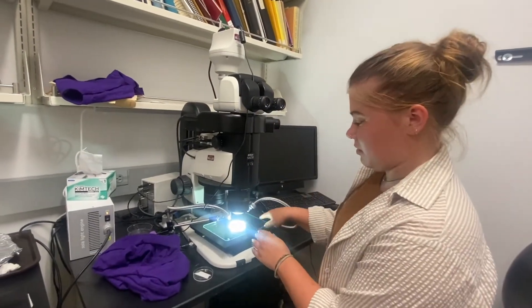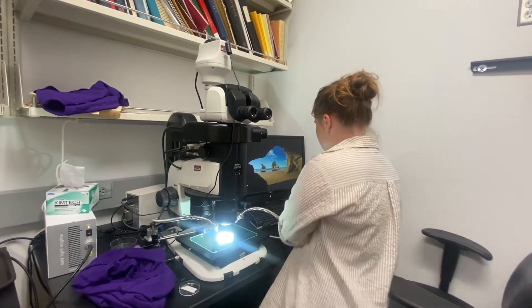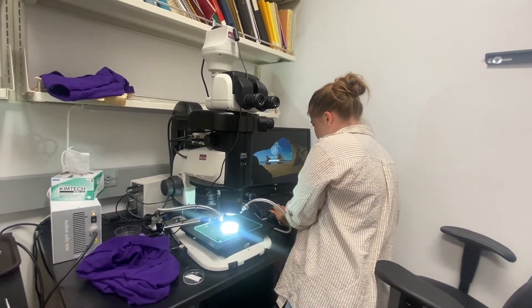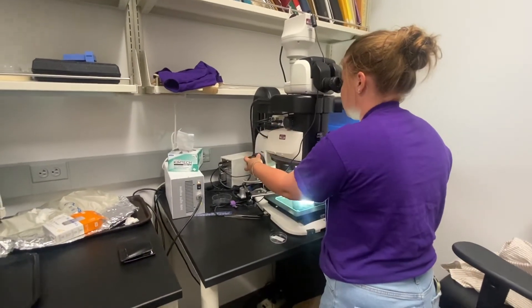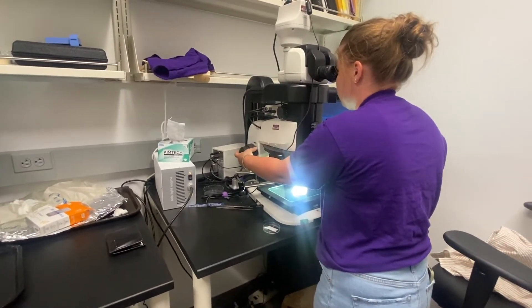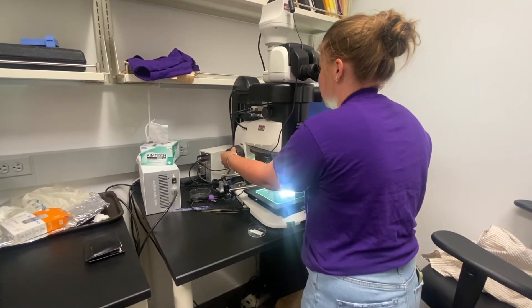And you just look at the whole thing, looking for any microplastics. Right here off the bat.